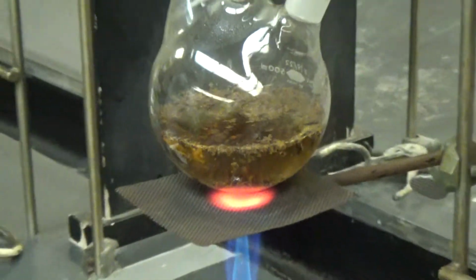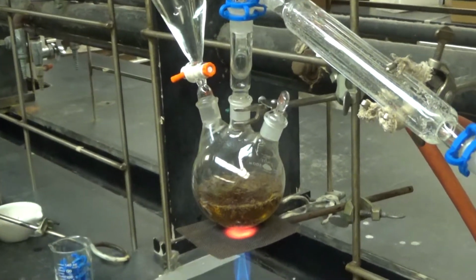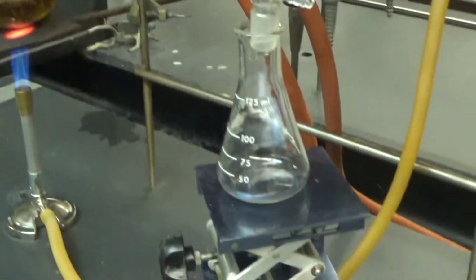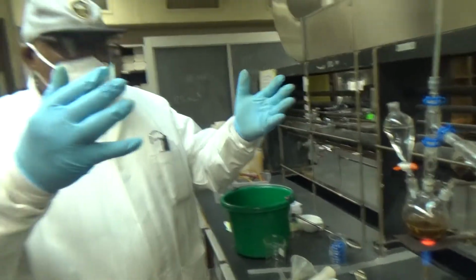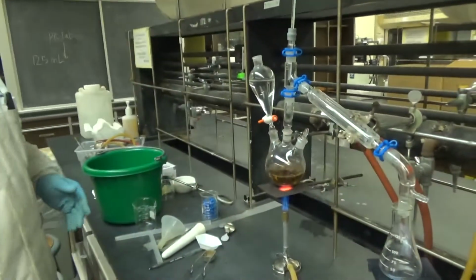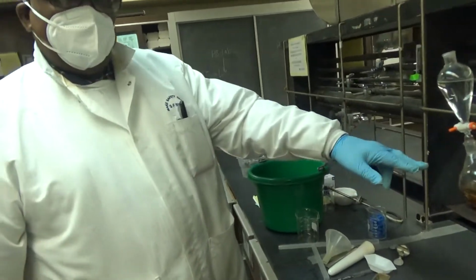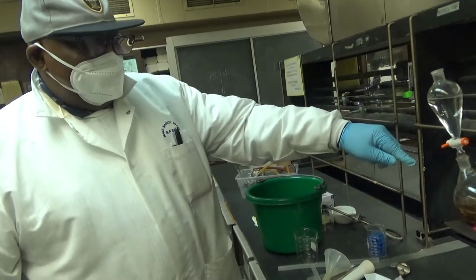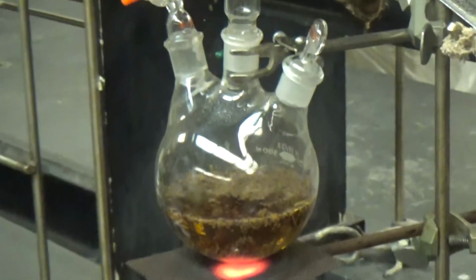And then once it starts boiling, you're gonna add a little more water, right? Not right away. Because once water starts to boil, when you distill, it's boiling, vaporizing, condensing, collecting here. Once it vaporizes, the amount of water is going to decrease, and then you can add more water from here. Okay, cool.